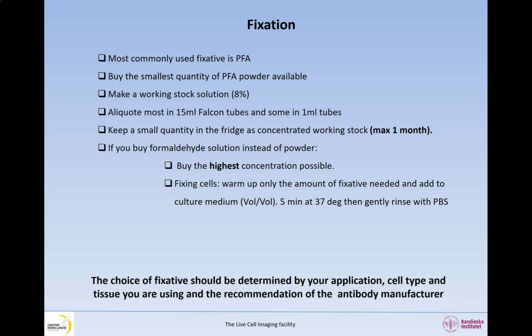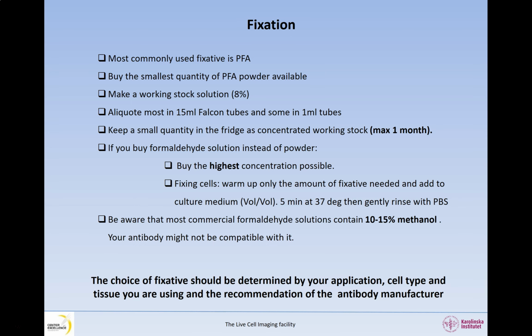After 5 minutes at 37 degrees, gently rinse the cells with PBS. Be aware that most commercial formaldehyde solutions contain 10 to 15% methanol. Your antibody might not be compatible with it.